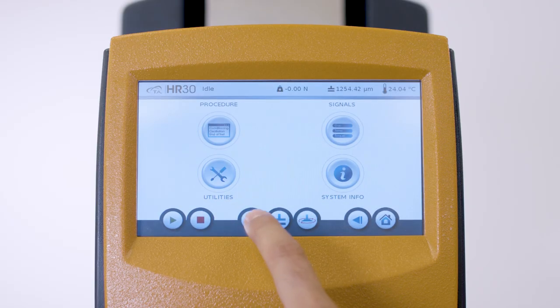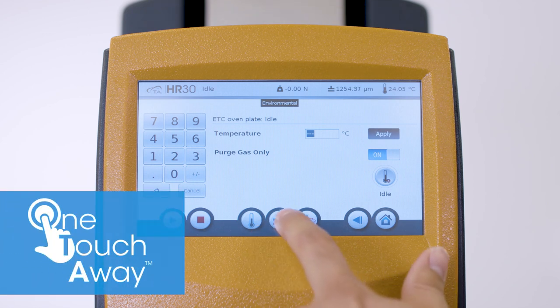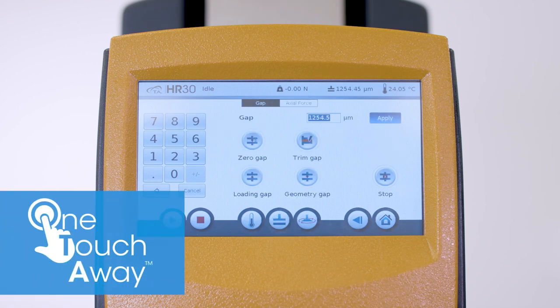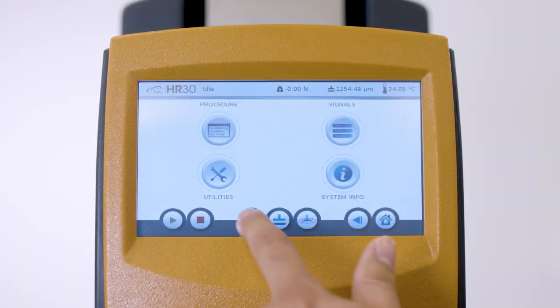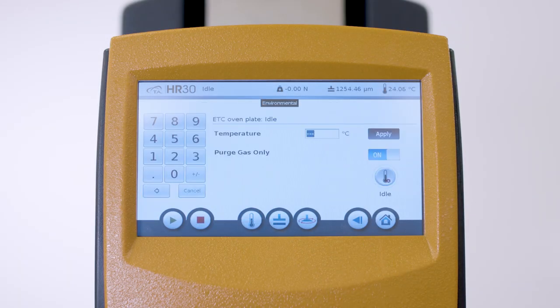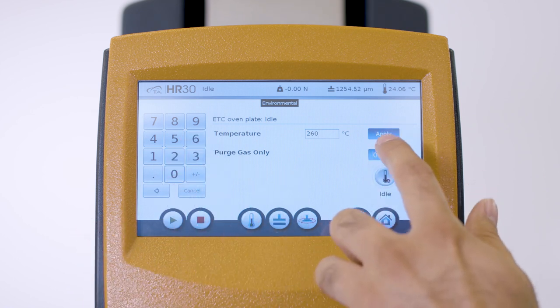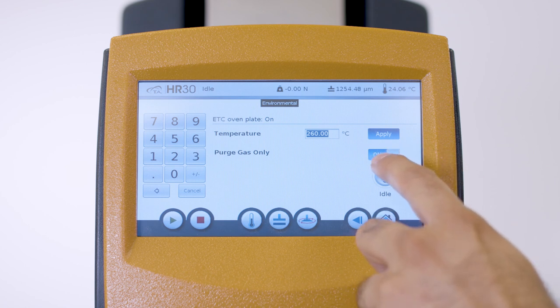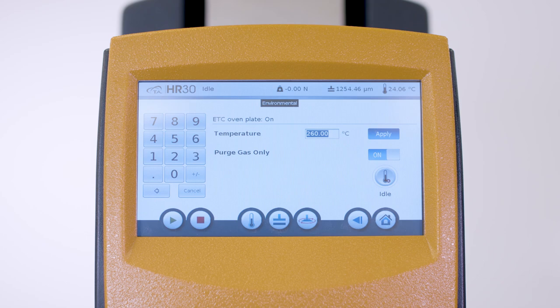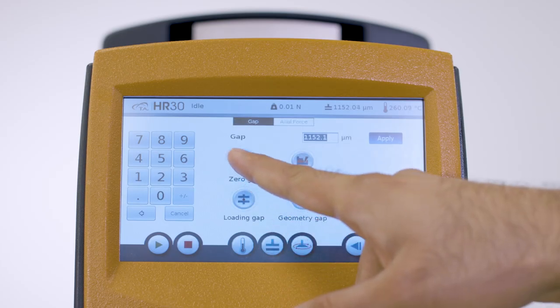The new Discovery Hybrid Rheometer is equipped with a brand new one-touch-away app-style touchscreen that greatly enhances usability by placing key instrument features at your fingertips. Using this touchscreen, preheat the geometry to the measurement temperature. Make sure you select purge gas only if there is no liquid nitrogen or ACS-based low temperature cooling accessories attached to your rheometer. Then zero the geometry gap at the test temperature.